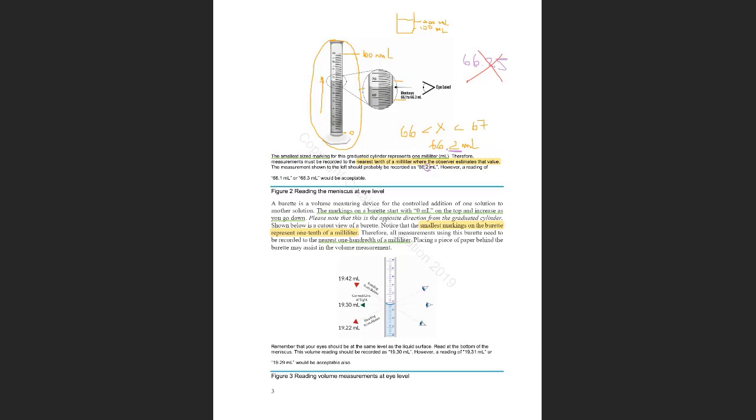Right, and it's not only the ruler, it depends on the scale that you are using. So let's say I have a different ruler that has a number 10 and a number 20 centimeters, and I don't have more markings.